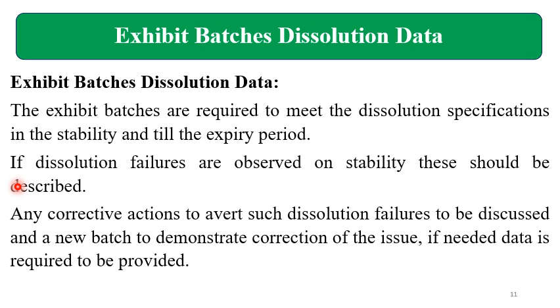documented. Any corrective action to avoid such dissolution failure should be discussed, and a new batch should be manufactured to demonstrate correction of the issues if needed, and is required to be submitted with the correct information to the regulatory authority.